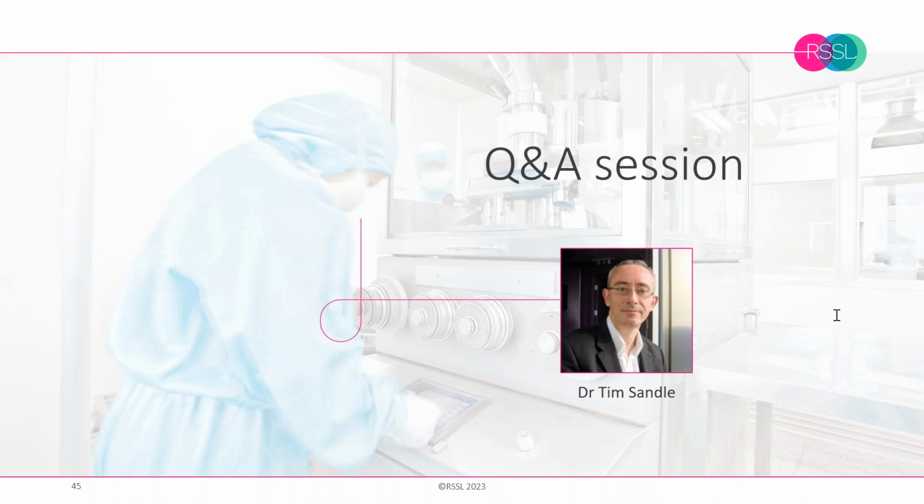Okay, and Raghu wanted to know what was the recommended percentage VHP concentration solution for bio-decontamination? So it depends on the agent that's used.